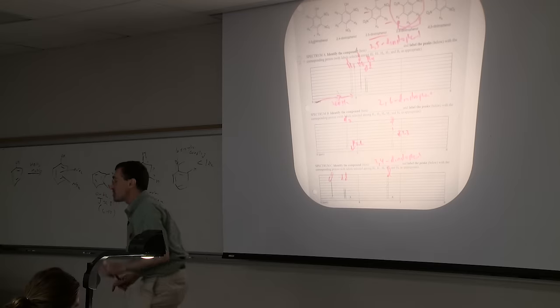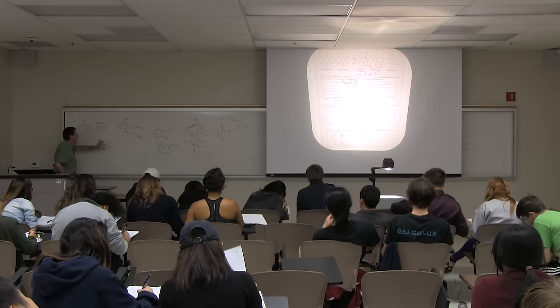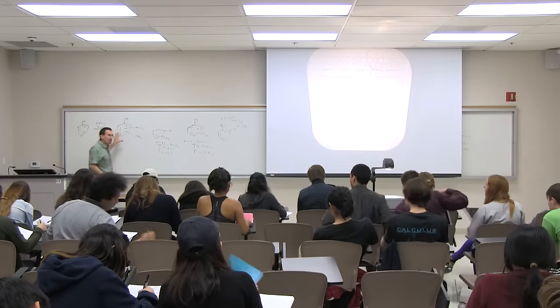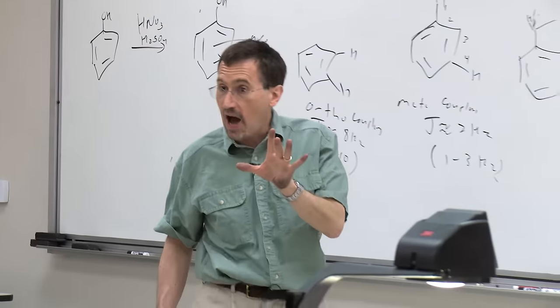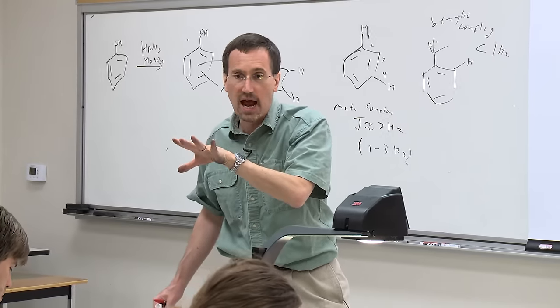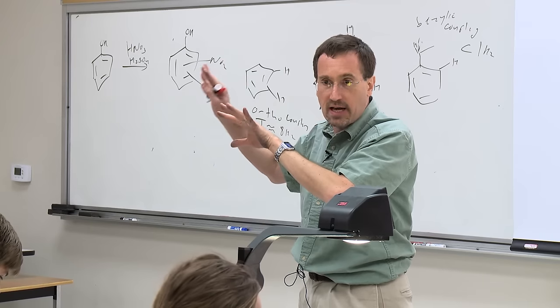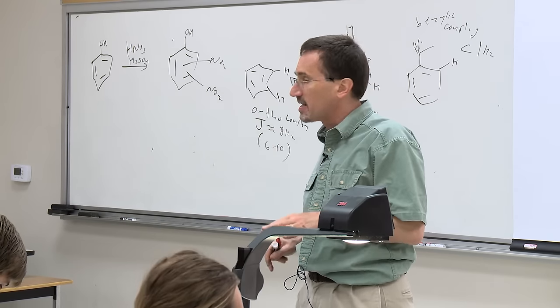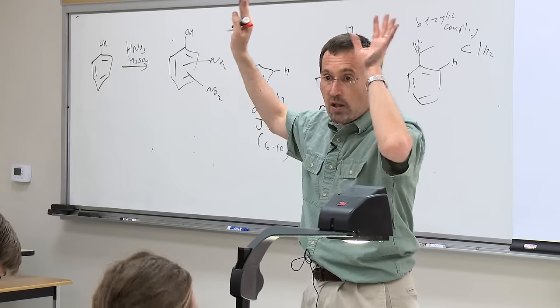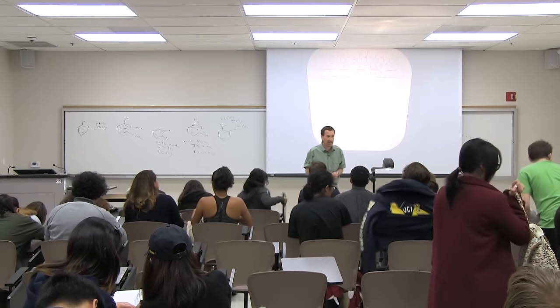And so you could imagine that if you did an electrophilic aromatic nitration of phenol, and you took your NMR spectrum of the crude product, just like we did with the mixture of isomers of bromostyrene, you could immediately analyze the multiplets based on their couplings and their relative sizes and say, I have a mixture of this dinitrophenol, that dinitrophenol, and maybe some mononitrophenol in there as well.